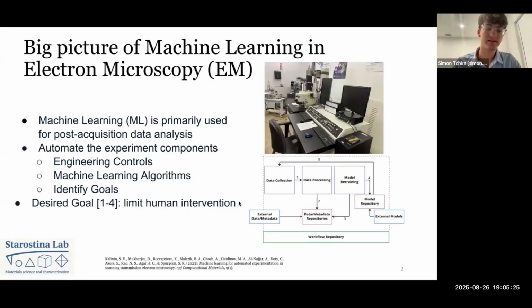Firstly, electron microscopy is a technique that uses a beam of electrons to create highly detailed images of tiny objects. It provides much higher magnification and resolution than regular light microscopes. Machine learning algorithms have been primarily used to identify which data points in the image deserve greater focus.